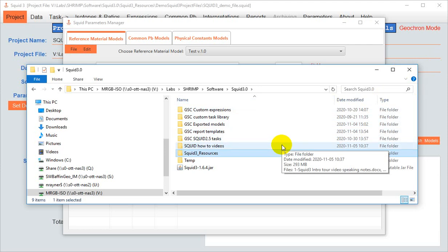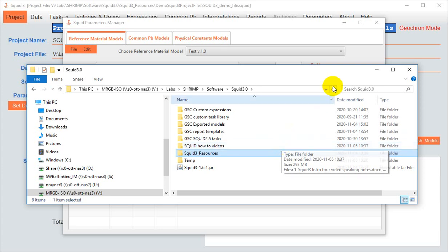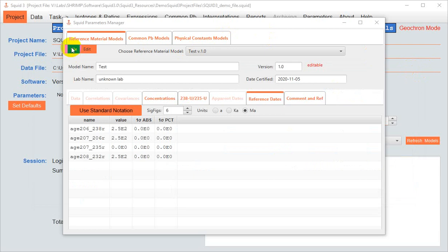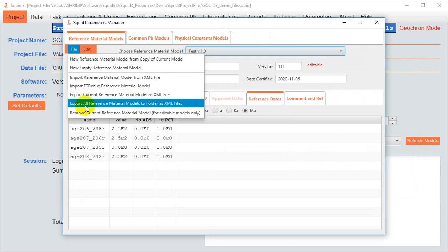And so, in order to easily make a master package of models that's available to all users, regardless of what computer they're on, we have this menu item here, which is export all reference material models to a folder as .xml. This way, the vetted set of models can live in one place where the assorted users can go and get them for import when needed.